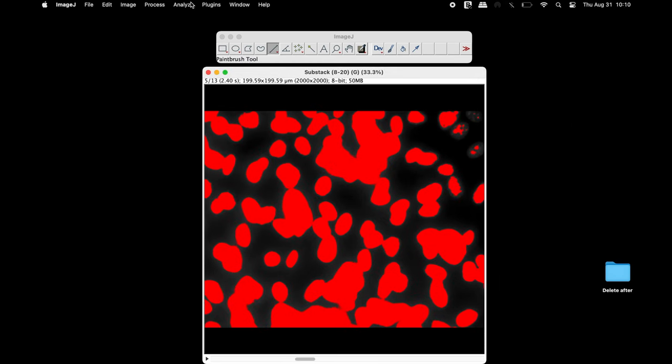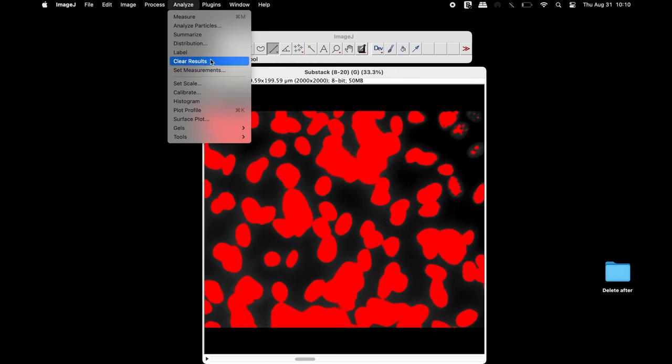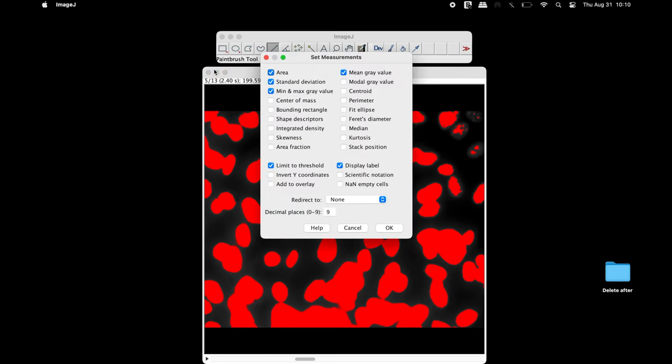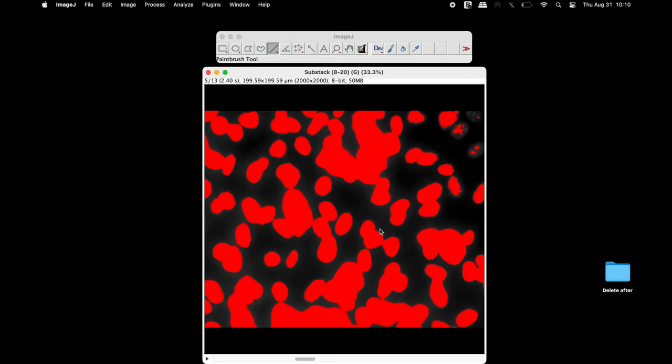Select the parameters in the Set Measurements window. For instance, the area, standard deviation, mean gray value and limit to threshold. Once completed, click OK.